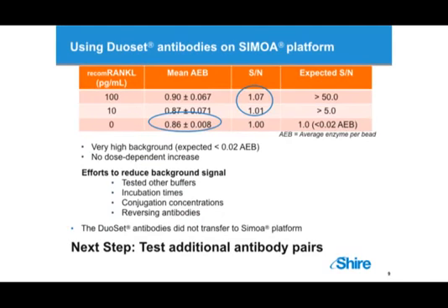So we went ahead and picked the R&D Systems DuoSet antibody pair because we can get larger quantities of the antibody. Also, there's a lot of literature available about these antibodies for RANKL assay. And R&D Systems itself is widely used in both university and industry laboratories, so why don't I go ahead and use that.